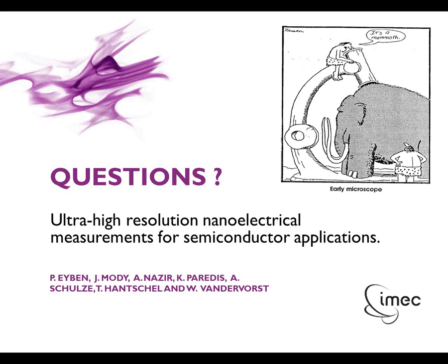Yeah, the typical application will be on metal surfaces and less on semiconductors. That's not because it's not possible on semiconductors, but it is because it really measures the work function, which can be strongly influenced by Fermi level pinning. As soon as you take a semiconductor surface and cross-section it, which is typically what we do in these types of samples, you will have some Fermi level pinning.